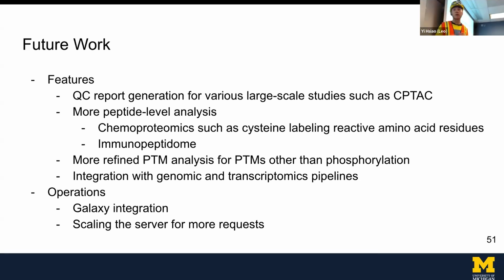Although in this workflow, with most of the CPTAC protocol, we are only able to get a composition, even different compositions on a single site are not used by most people for large-scale analysis. So for our package development, I will focus on this first, since it explores another layer of complexity compared to other PTMs.